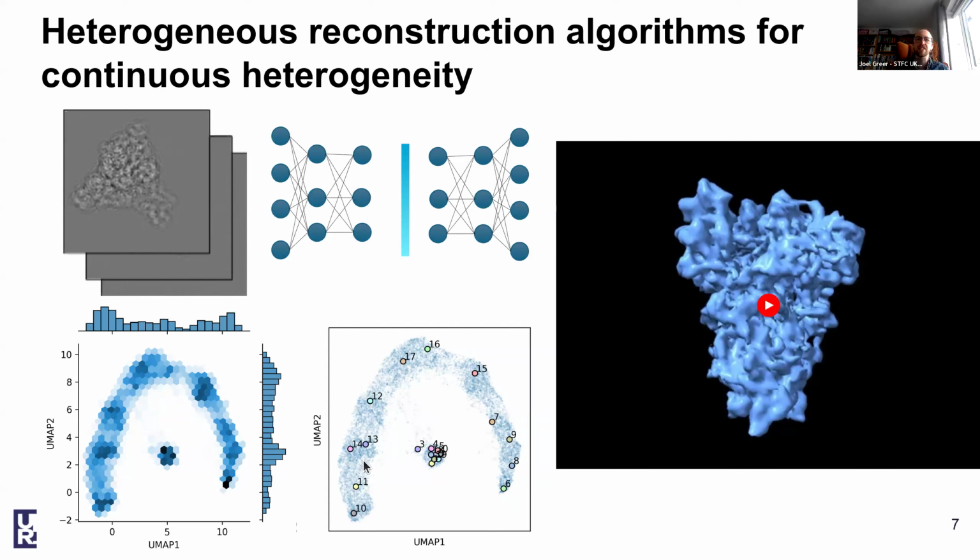And I also show you a scatter plot. Here, each of these tiny blue dots corresponds to one particle image, and exactly where the embedding of the heterogeneity is in this latent space representation of heterogeneity. On this latent space, I've performed a k-means clustering with 20 in order to find 20 representative particles, which essentially represent the range of heterogeneity present in the data set.